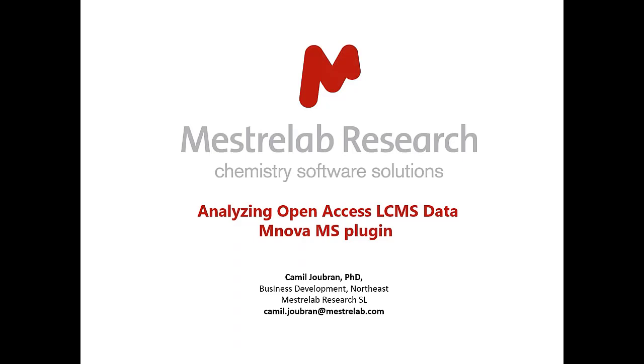So I'm going to present maybe 5 slides, just an overview, an introduction, because my main focus is the workshop and going through the demo and answering questions at the end. The workshop will be around 45 minutes or so with the presentation, demo, and questions at the end. It can go longer if I want to answer more questions. So let me get started.